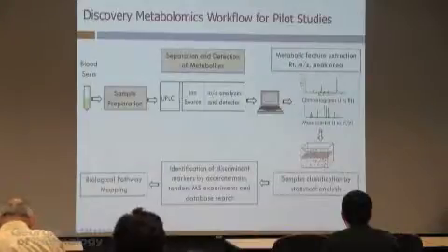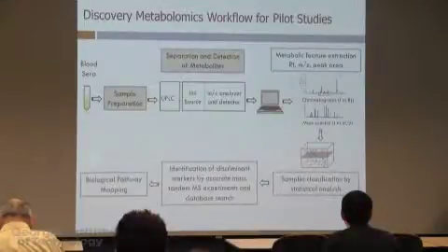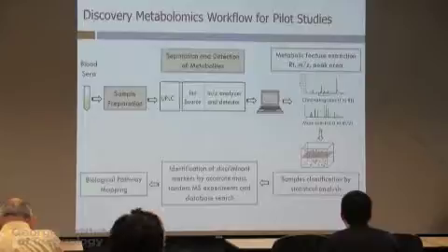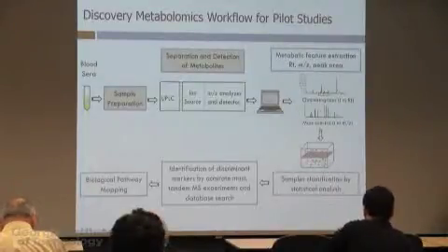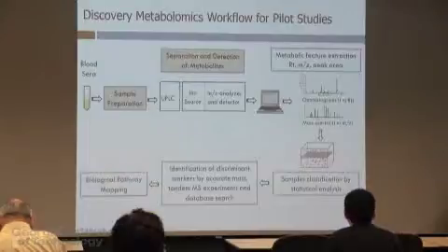If you go to a conference where somebody's talking about metabolomics, some people will claim, oh, I am detecting 1 million metabolites. That is wrong, okay? They are detecting 1 million peaks. Those peaks may not be metabolites. They may be contaminants from the VWR methanol, contaminants from your column, okay? So you got to be very careful and curate that data to make sure that those peaks are not known contaminants, those peaks are not in the blank, and so on. Okay, so be very, very careful with that step.